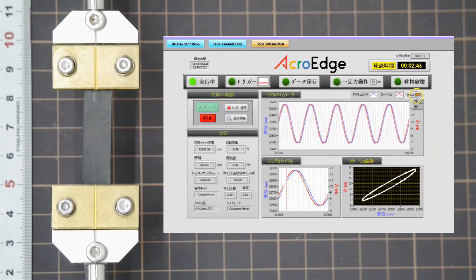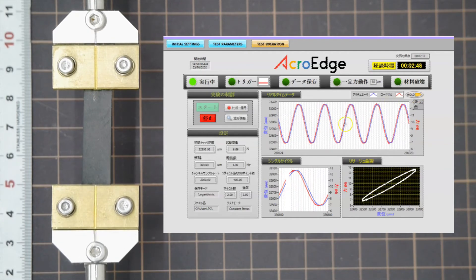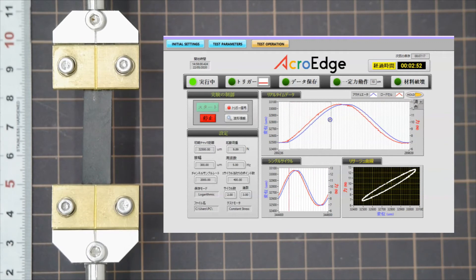In this rubber sample, a time delay between the applied stress and resulting strain curves is characteristic of its viscoelastic properties.